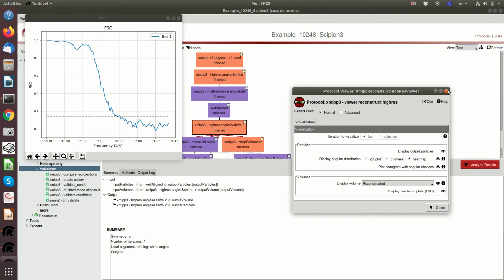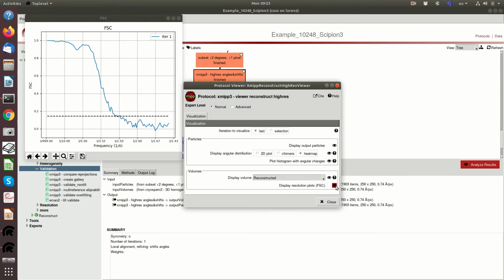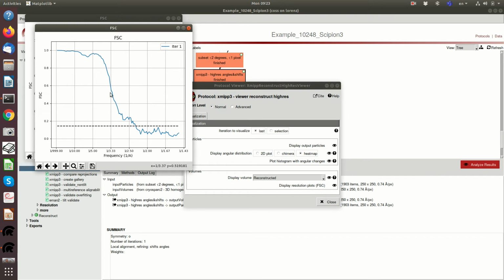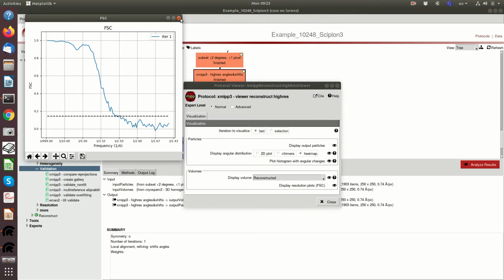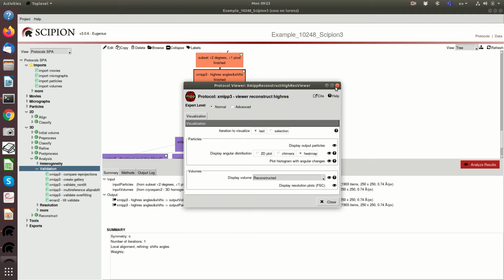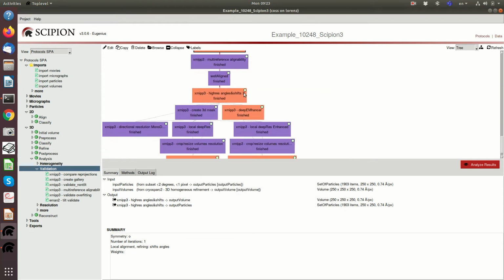This time it is 3.3. In this case it was a bit better than 3.3, it was 3.2, but we are losing more and more particles in the process, and with this very low number of particles, that could be problematic. If we have many more particles, that is not that problematic.